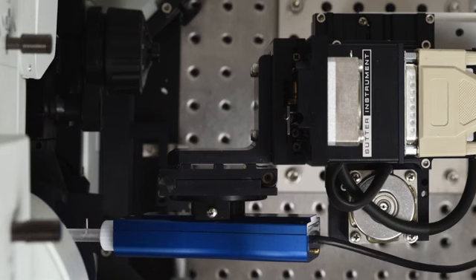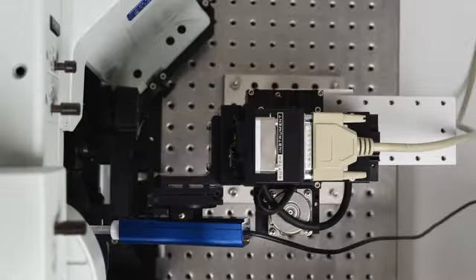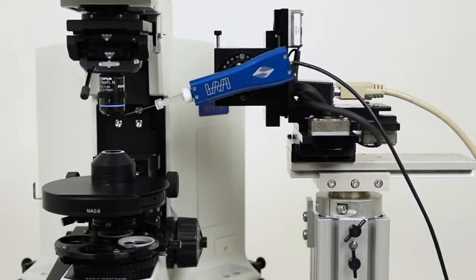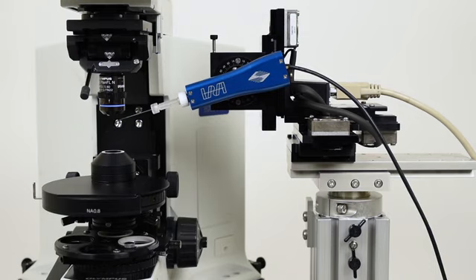The right angle adapter will give the manipulator an added 1.5 inches or about 40 millimeters of added reach. This allows you to move the manipulator farther away from the microscope and still be under the objective. By turning the manipulator 90 degrees, it is now free to operate without obstructions in its path.